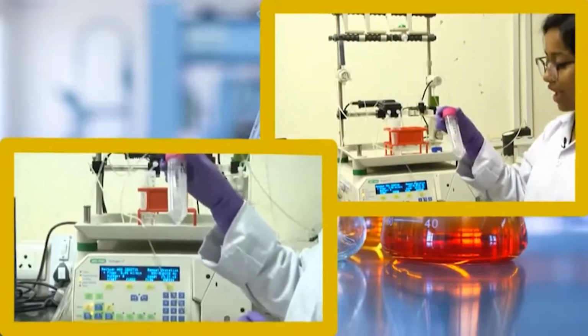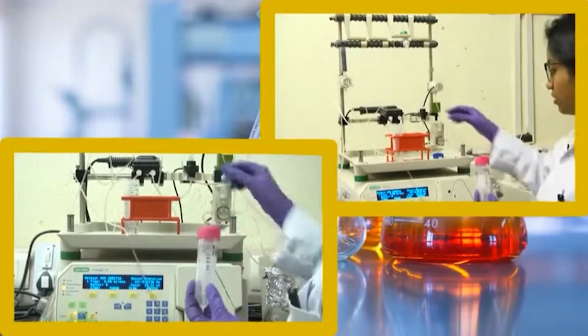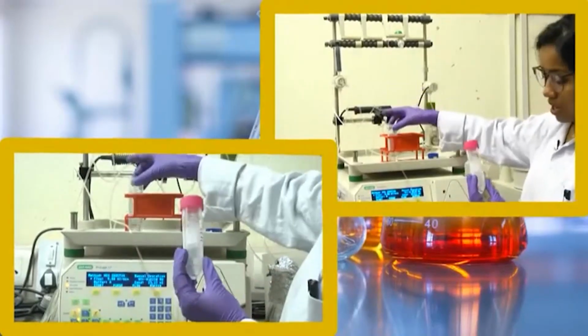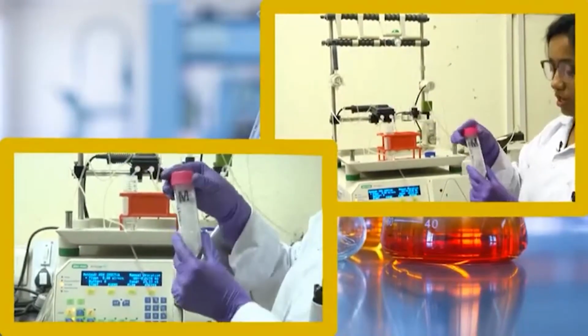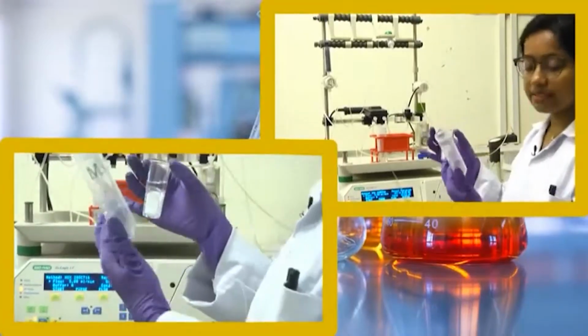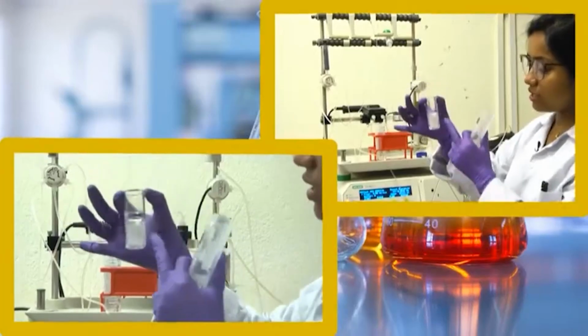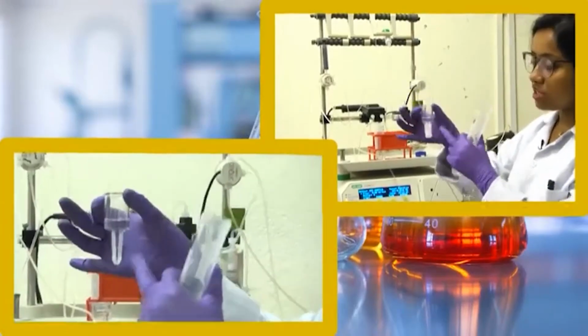it looks like a Falcon tube, like the centrifuge tube which we have been using previously. But it has two things. Along with this Falcon tube, it has a small holder like this, and you can see there is a white patch. So, this is the membrane.